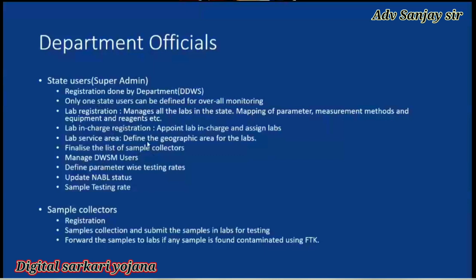If the super admin says your lab data is correct, everything is correct, then the super admin should raise the issue with the DDWS, that for that lab in charge there is an issue. Similarly, update NABL status. They can update NABL status for any labs and sample testing rates. So these are the features of the state user, meaning super admin.